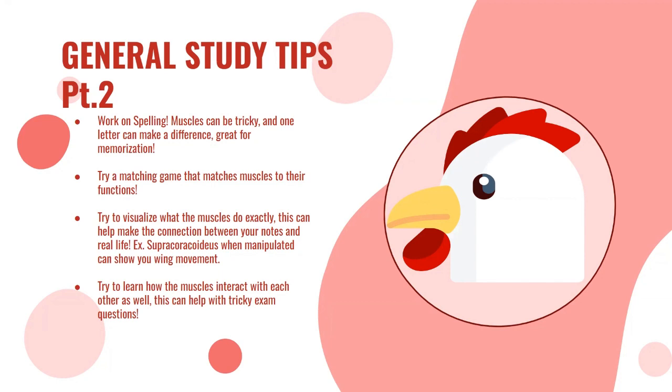Examples of supracoracoideus, when manipulated, can show you wing movement. And lastly, try to learn how the muscles interact with each other as well. This can help with tricky exam questions.